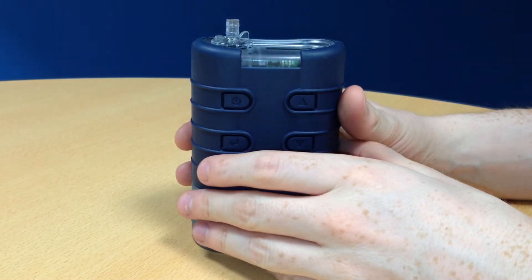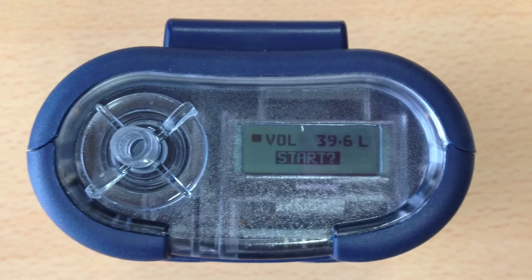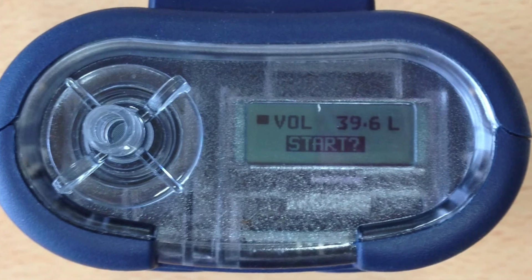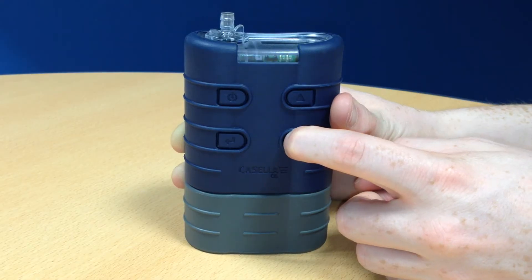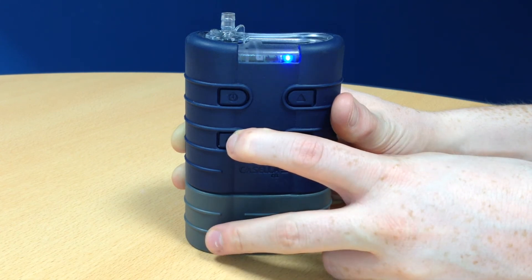To unlock your Tough Pump, press the power button three times again in quick succession. The padlock will disappear from the display and the keys in the Tough Pump will become operable again. For more information on the Casella Tough Pump, please go to www.casellasolutions.com.